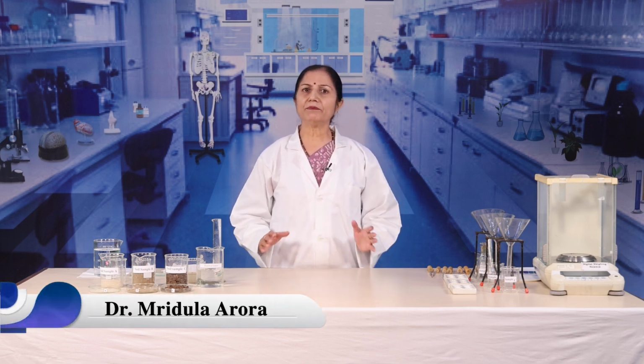Hello dear learners, in this session our aim is to determine the pH of different soil and water samples. As we know, pH is a measurement of hydrogen ion concentration in a given solution. Soil pH is an important parameter affecting the growth of plants as it governs the availability of nutrients to the plants. Similarly, pH of water determines its solubility for nutrients and its bioavailability to different life forms.